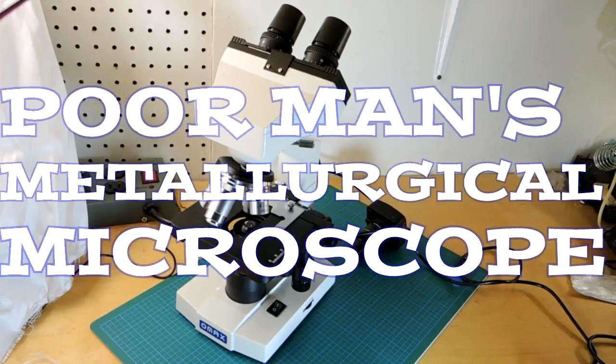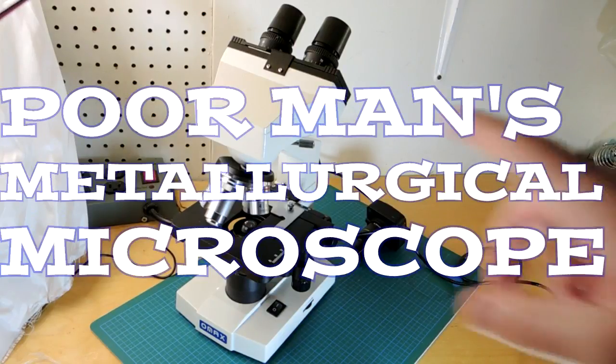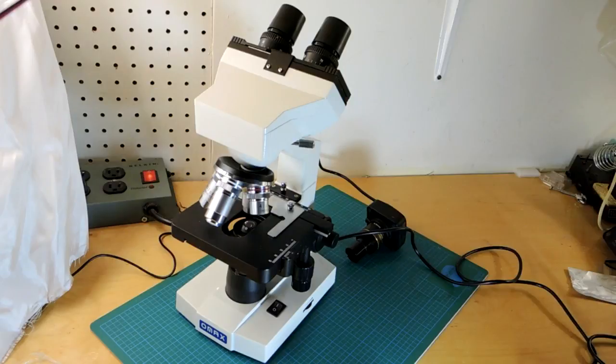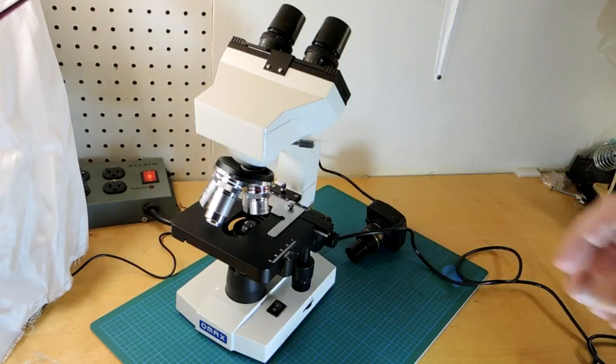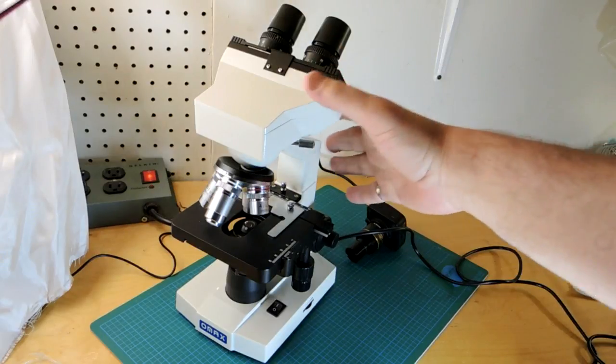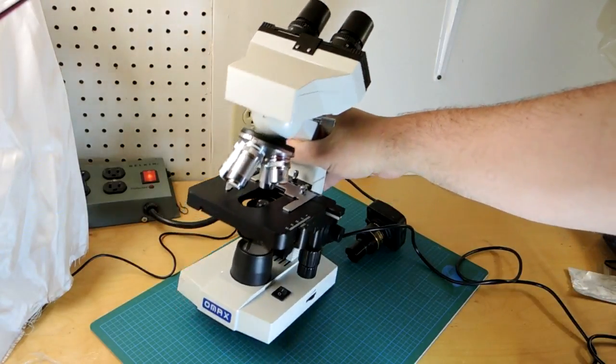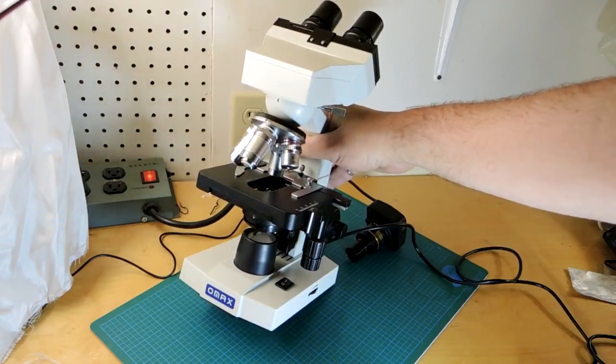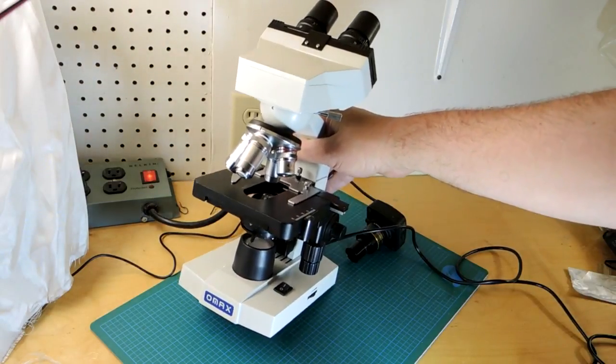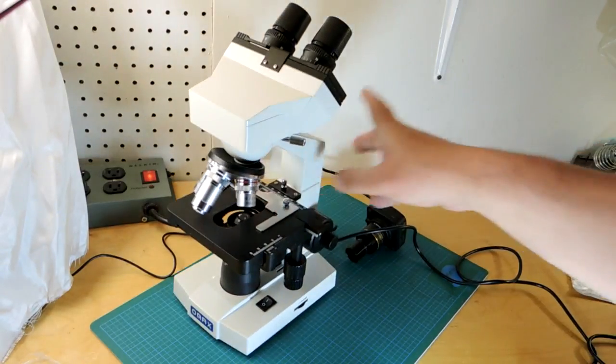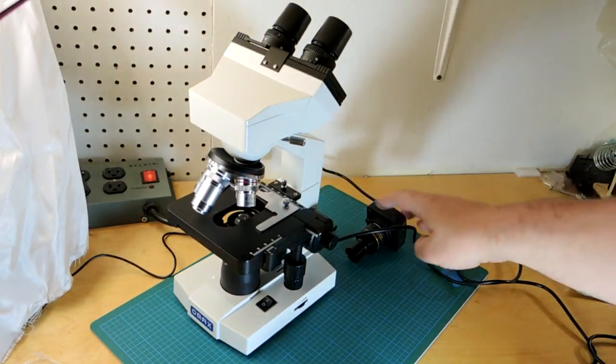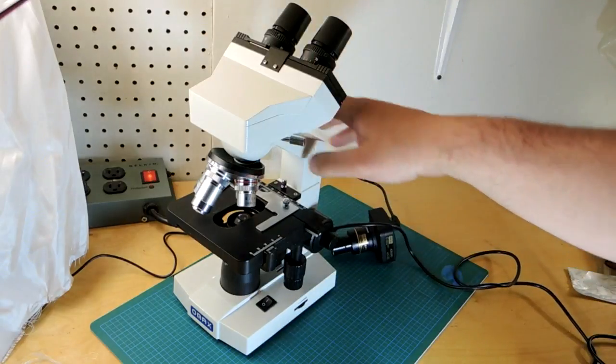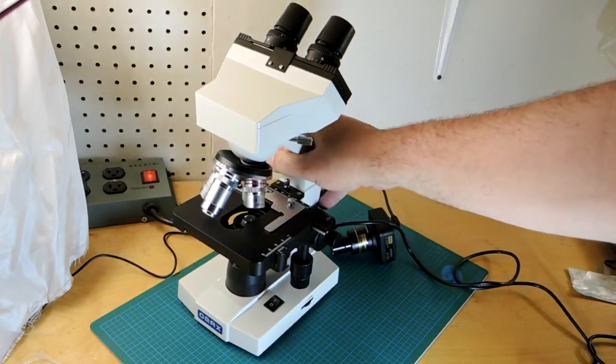This video is on modifying this microscope so it's more usable for the purposes I use a microscope for. This is a really nice microscope. I grabbed it off Amazon. It cost just a bit over $300 for a stereo microscope with a camera and it's actually pretty decent quality.